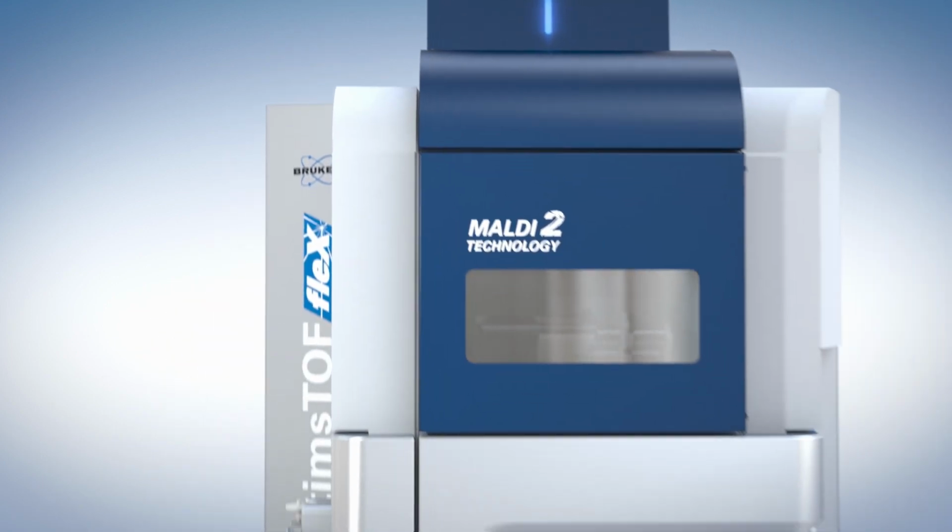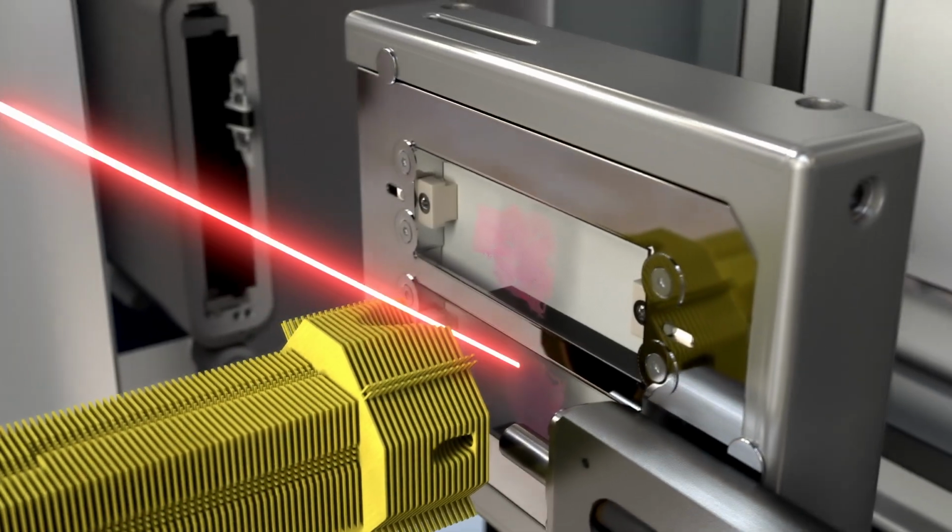So after 2014 we first published the Science paper, and I think this was really a game changer. At a conference in San Diego, I talked to Jens Höndorf from Bruker research and development, and then we stayed in touch and started thinking about how we could maybe do something together in that area, and then we were thinking about the best ways to actually get the second laser into the timsTOF instrument.